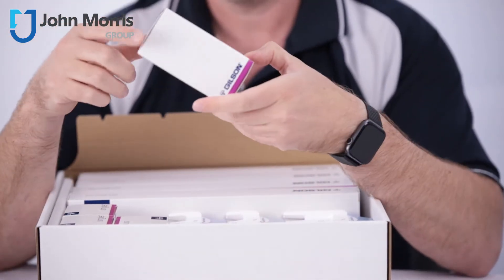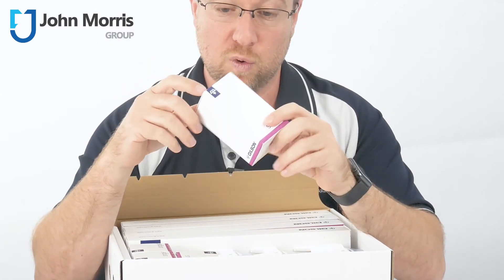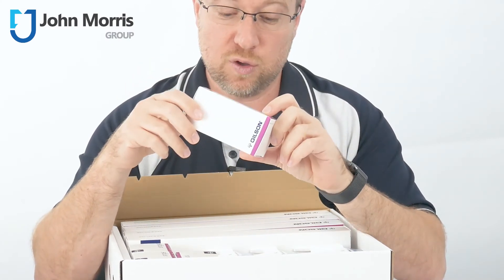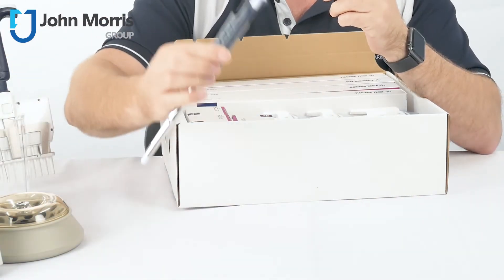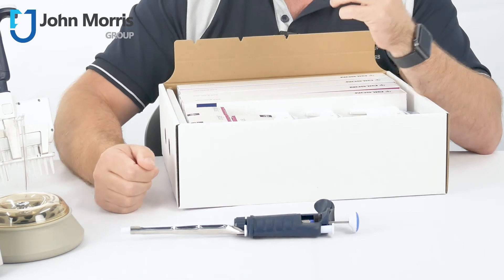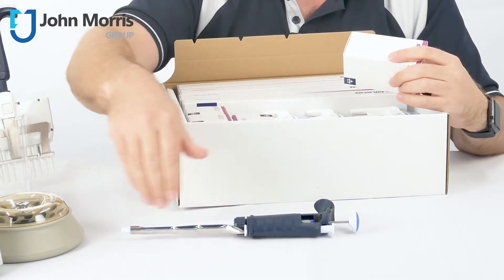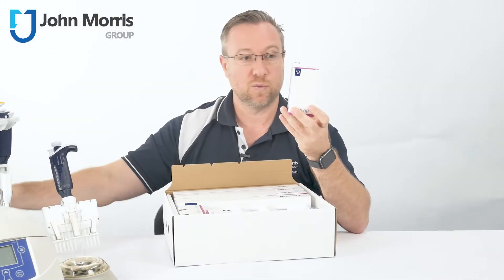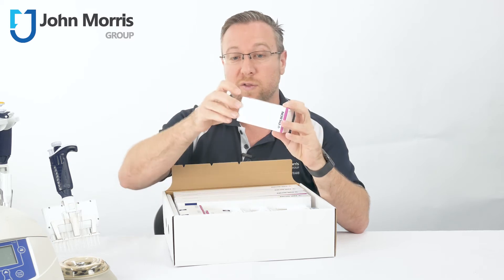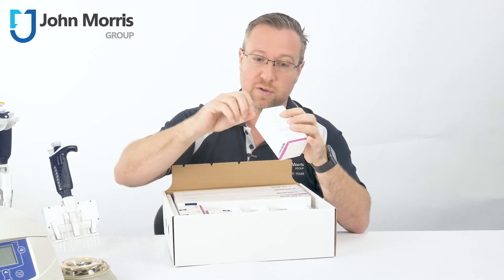Here you'll see we have four singles, and what these are for is to hang your pipettes up on the wall or on the bench. You should never leave a Gilson pipette — or any other brand of pipette — lying down, because that helps any liquids inside the pipette to travel up into the body of the pipette. These handy little hangers have an adhesive side on them, so they stick up on the wall and your pipette hangs right onto those.